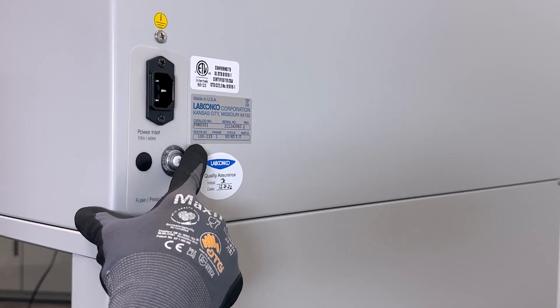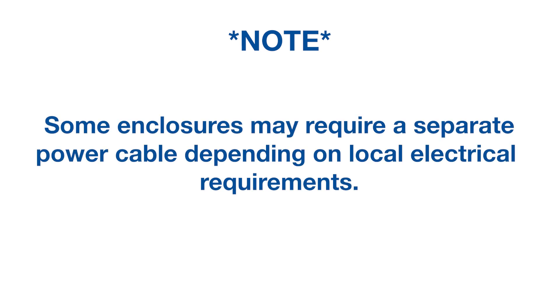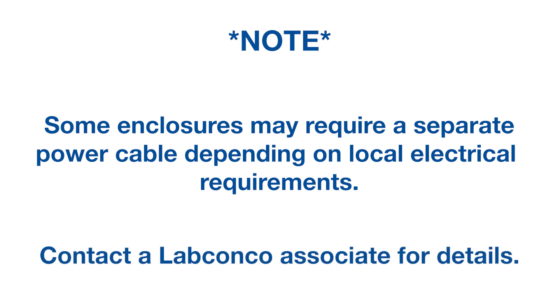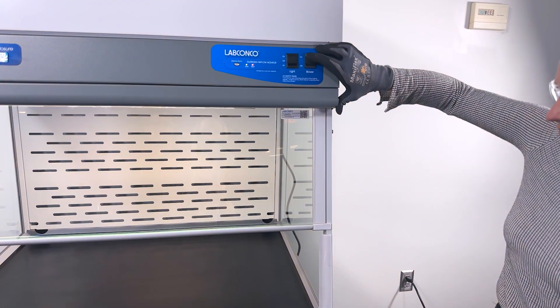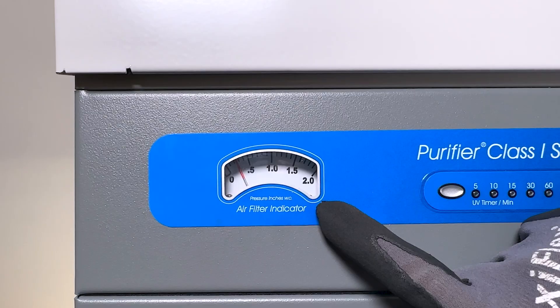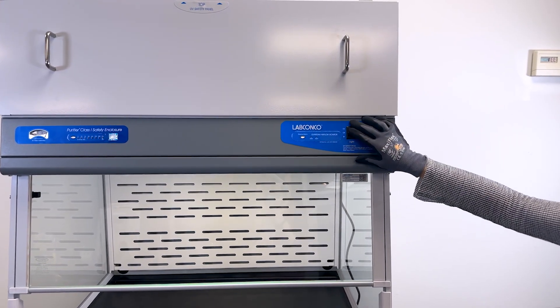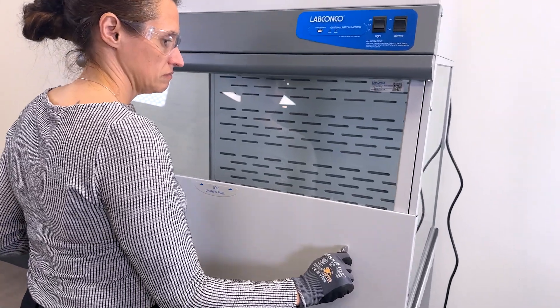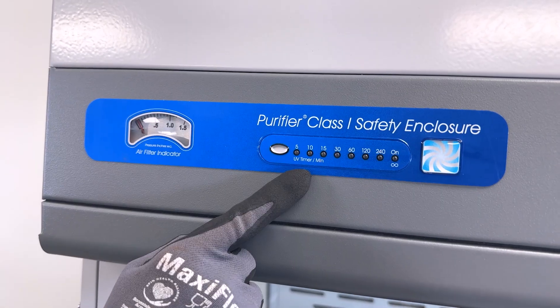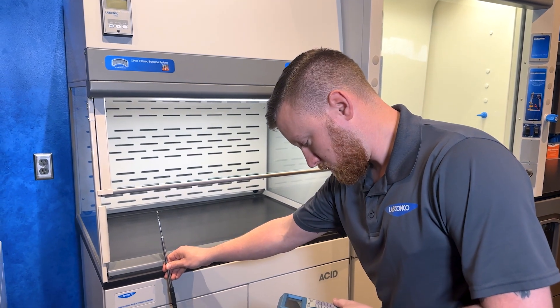Connect the power cord into the back of the unit. Verify the enclosure's power requirements noted on the rear serial label and plug the cord into an appropriate wall outlet. Note: some enclosures may require a separate power cable depending on local electrical requirements — contact a LabConco associate for details. Finish by testing the enclosure for operation: test the interior light, the blower should turn on when the rocker switch is activated, and check to make sure a static pressure reading above zero inches is visible in the differential pressure gauge. Turn the light and blower switches off. Finally, test the UV functionality by placing the UV panel over the access opening and turning on the UV light — it will operate for a set duration, which is adjusted using the controls on the left side of the enclosure's front panel.